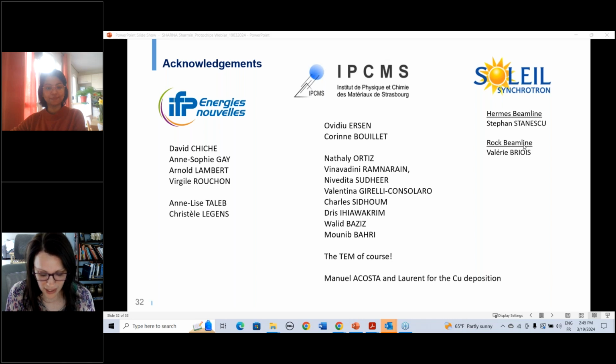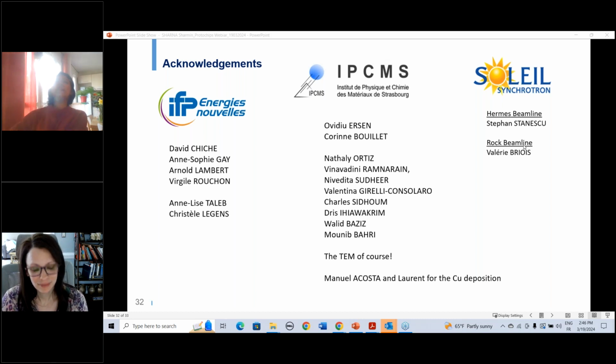Did you notice if any specific facets of the copper nanoparticles were more active than others, or how the facets may have changed the activity or your observations? I mean, no, we haven't really looked into the faceting aspects or the surface, because since we are not really involved with catalysis, it did not really affect us.